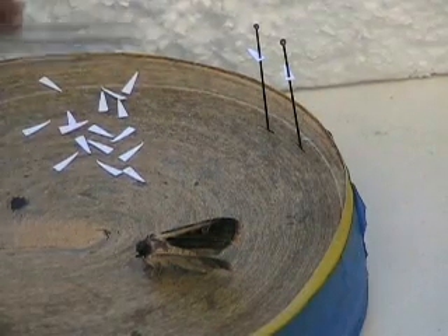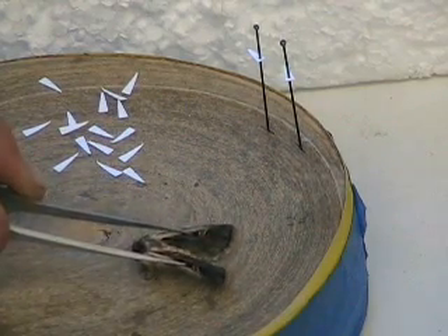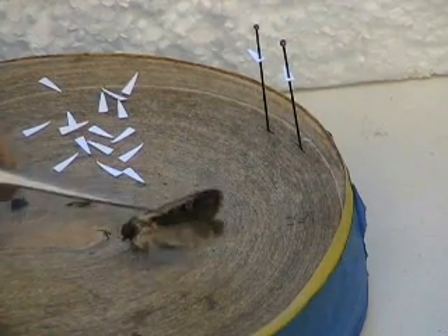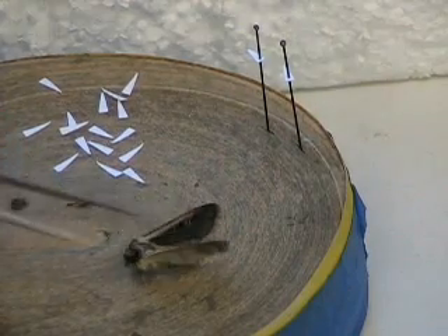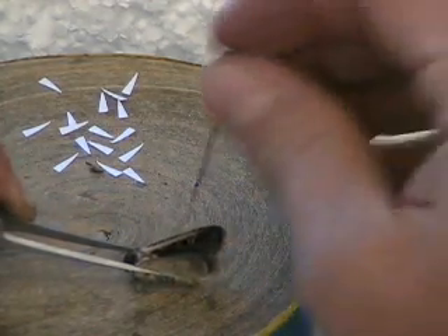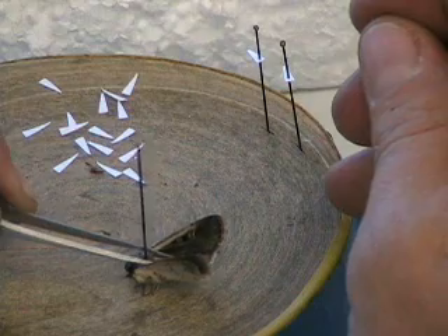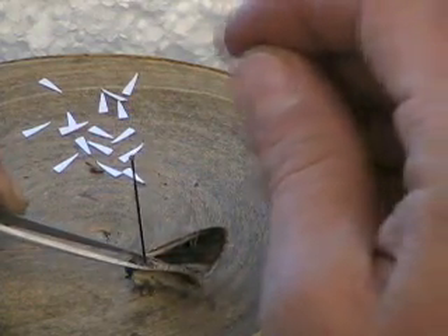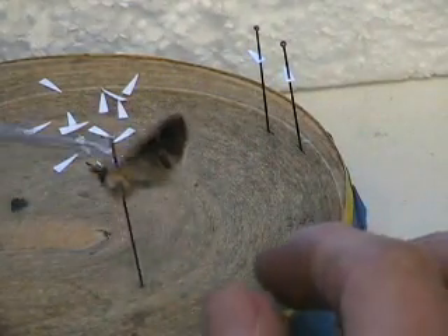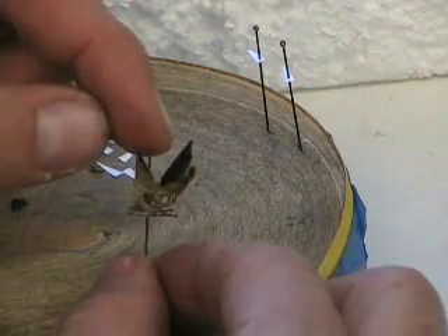One consistent problem with pinning Lepidoptera is they don't always die the way you want them to. It would be great if they all died with their wings completely flat, but that's not always the case. Sometimes you'll have difficult specimens where the wings are kind of upright. The best way to pin a specimen like this is to hold the thorax, pin it through the center of the thorax, and use your forceps to hold the wings back. Hold the thorax down on the pinning block, press the pin down to where you want it, and the specimen is pinned — ready for the wings to be spread.